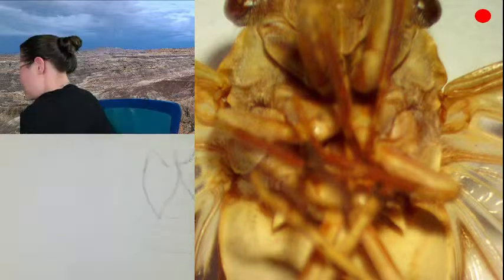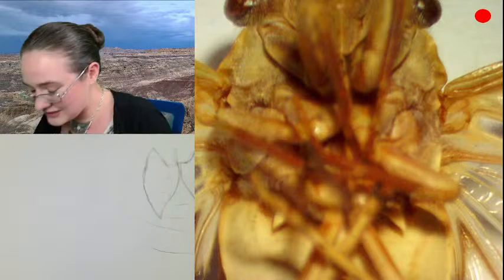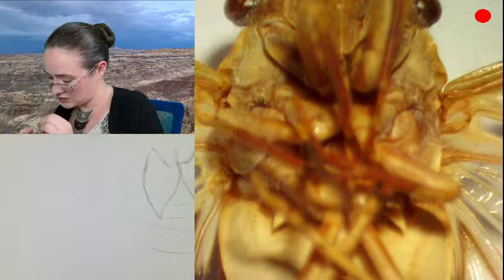Alright, I'm going to get the labels back on my specimen, because that's one of the things that I have to do. I've got to take these locality and identification labels off when I flip my specimens upside down. And then I really, really need to remember to put them back on. I have one or two labels over here that have been disconnected from their specimens. I'm waiting for them to come back around. That's no good.